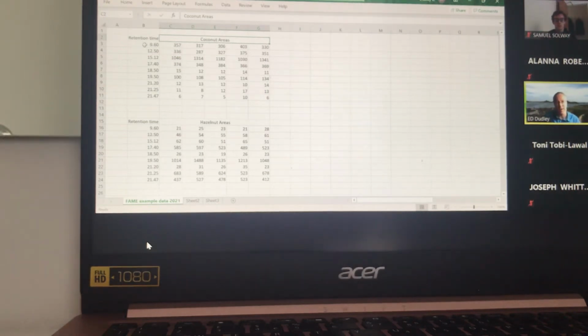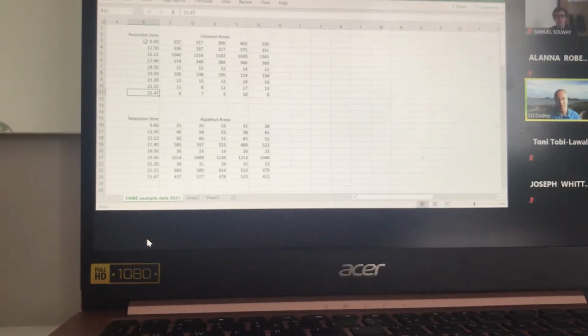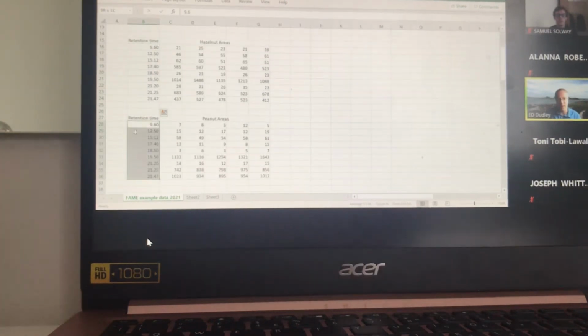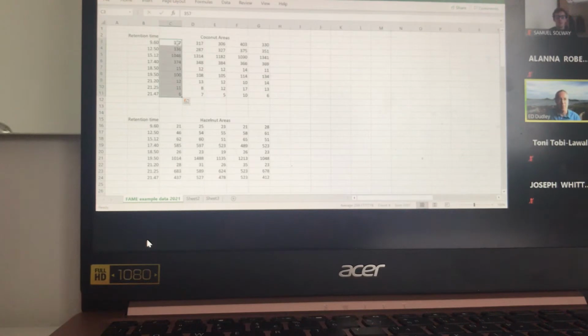We analysed by GCMS, and here are the retention times of the peaks we saw in GCMS. And we have the same retention times for every single sample. So we've recorded the same retention times for each of the 10 different samples and each of the 5 replicates. And then each of these columns here represents the peak area associated with each retention time for each of the 5 replicate extractions. Obviously, this peak here seems to be the most abundant. In this one, it seems to be this one.